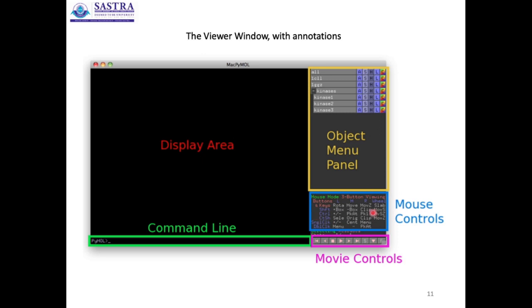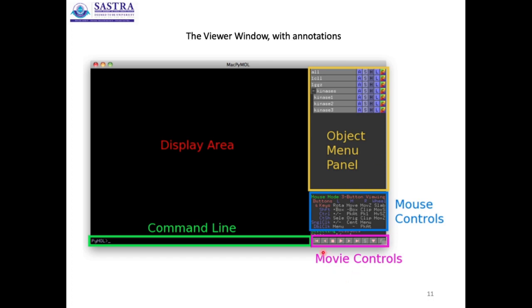You can select specific residues listed here and perform manipulations using the available toolboxes. The mouse controls depend on the mouse type — three-button viewing, three-button editing, or two-button mouse. You can also see the movie controls at the bottom to play, stop, forward, and reverse — for example, NMR structures with multiple ensembles can be visualized as a movie. A detailed description of PyMOL operations is available in the user manuals shared in the classroom. Mouse controls include rotation, movement, zoom, slab, clipping, and other options.